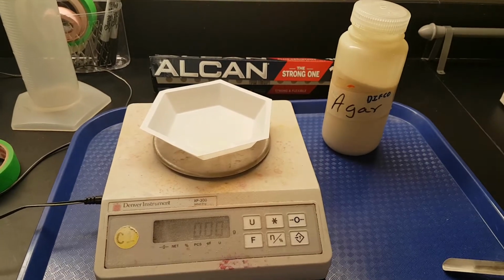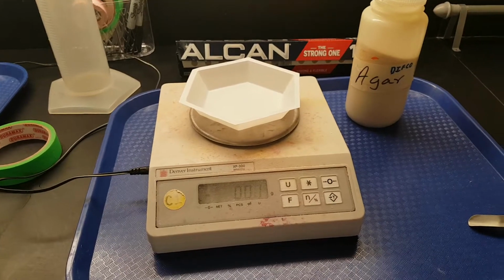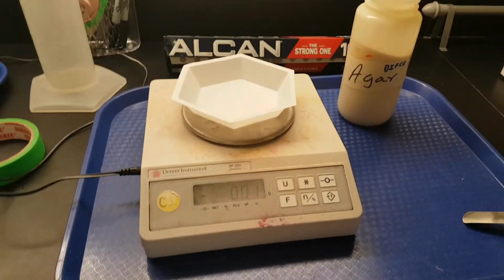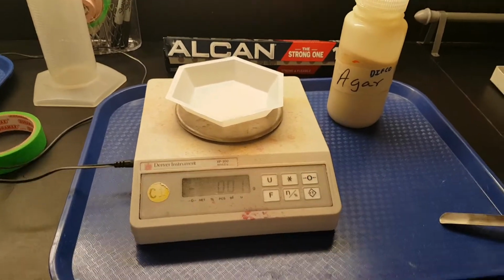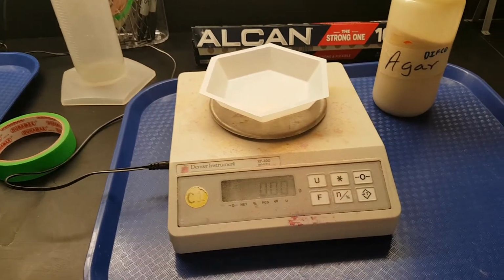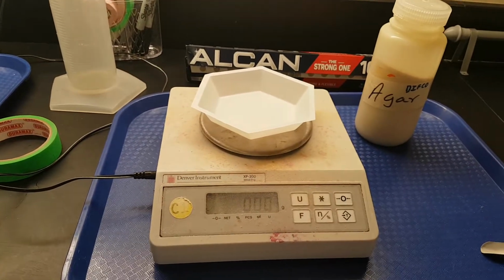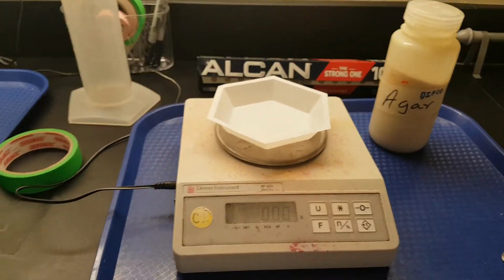is to turn this into agar. So we have our BHI broth and we have our BHI agar. And the only difference between them is that we add agar to it, which helps to solidify it if we want to use it for deeps or slants or plates, which is what we usually make from them. So we talk about BHI plates or PCA plates or whatever.